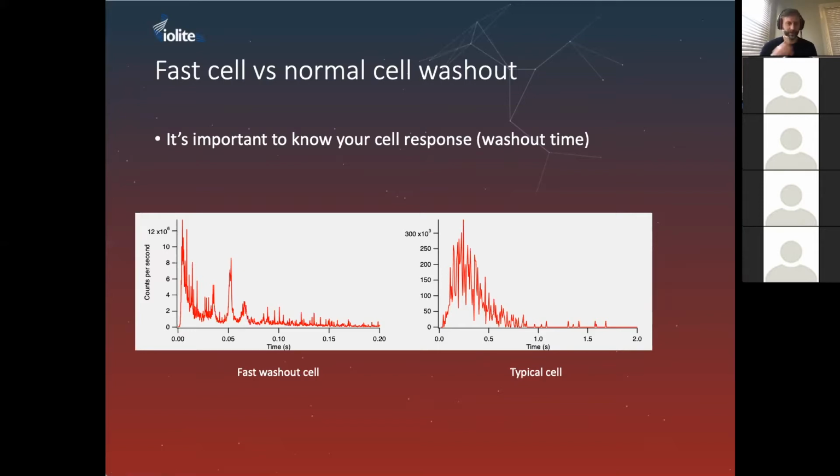I think the 3 major laser instrument manufacturers have different approaches. So there's going to be differences in these peak shapes, but it's quite interesting, and it's something that we're working on at the moment. But just to let you know, we're talking about traditional, typical cells for the rest of this webinar.